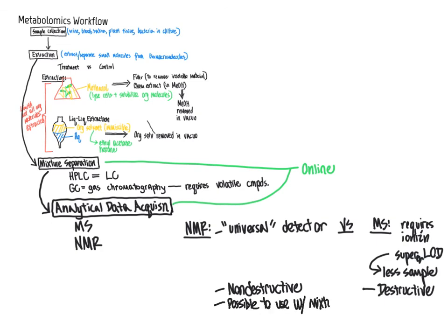When we look at NMR data and evaluate the ppm axis of a proton NMR spectrum, the different signals representing different chemical environments and different compounds are spread across that x-axis, providing us some ability to differentiate between compounds that are present in treatment versus control samples.